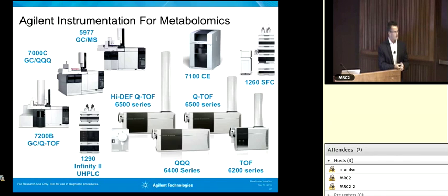So with that in mind, we will take the metabolite list that we generated, along with the data, and feed it into ProFinder, and it's going to mine it automatically for you for signal. The results are then presented to you in 3 places. We have the chromatogram here, and we're looking again at fumarate to keep everybody on task. We'll see our mass spectral results, and you can see at time 0 we've got no incorporation. At 8 hours we've got a significant growth of the fully labeled M+4. And then we also have a bar graph representation of this. We can have error bars, and we can do it with the natural abundance correction.